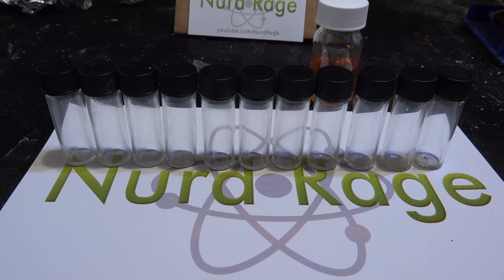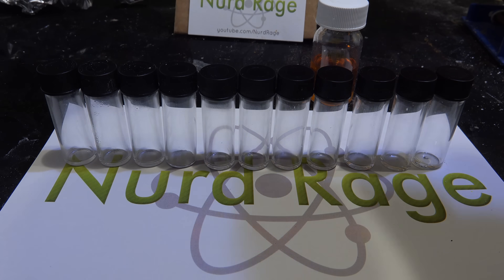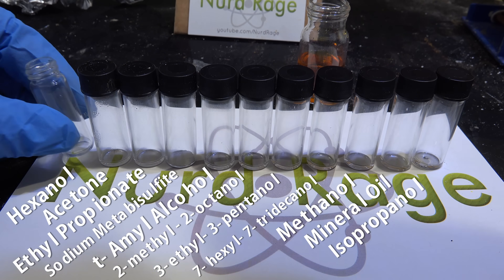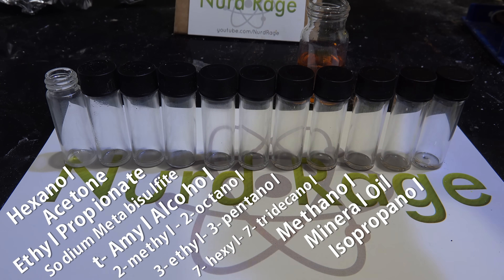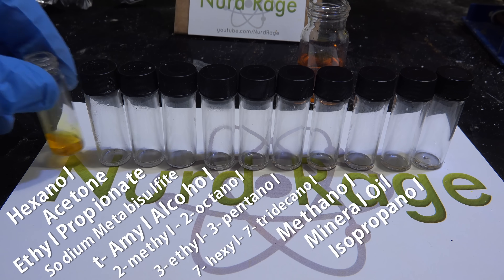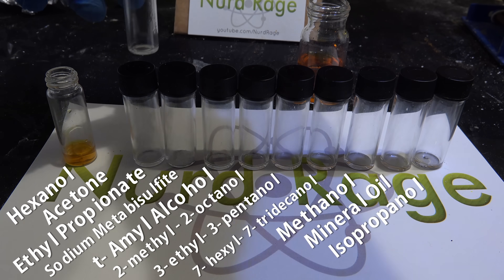So let's use it. I've set up a whole array of organic and one inorganic compound to test, by adding about 5 drops to each vial. In each vial I'll add half a milliliter of the dichromate test solution.